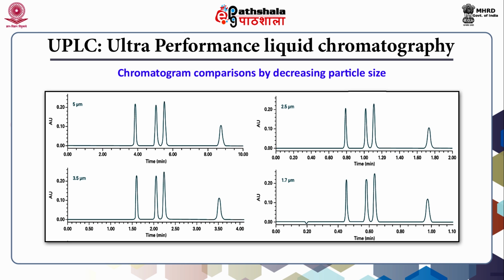If you see the top left figure, in which the stationary phase contains 5 micrometer particles, the first peak comes at 4 minutes.